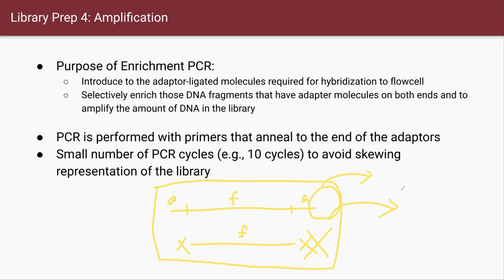So after your PCR, let's say this is 50-50%, but after your 10th cycle, you exponentially increase the proportion of these ligated libraries, then you get most of the proportion with these libraries, right? Then your sequencing will be super useful, right? So this is basically why we use the PCR enrichment for library preparation.